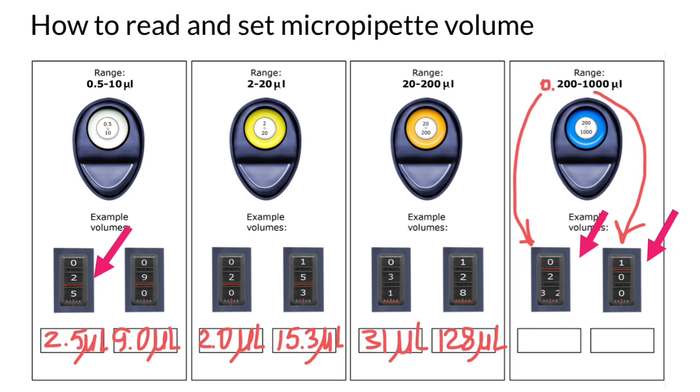So this line is thousands, this line is hundreds, and this line is tens. And what we see here is 0.225. One more time, it is easy to make a mistake here. As you see, numbers are going from left to right in decreasing order. So this is not 35, it is 25. Imagine we have 1 here, 4 here. So as you see, it is 225 microliters. We also can say 0.225 milliliters. And on the right, we have not 1 microliter, but 1000 microliters, or we also can say 1.0 milliliters.